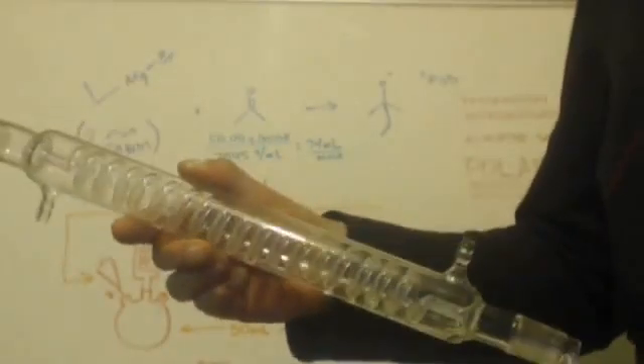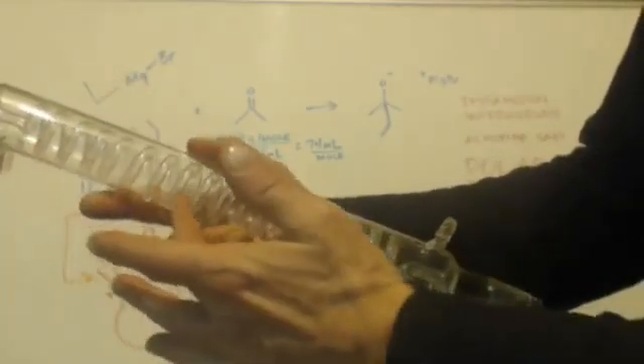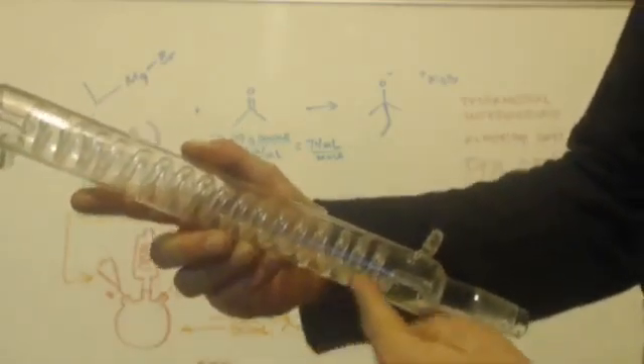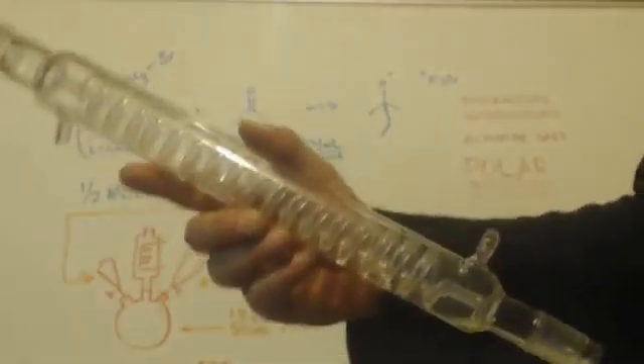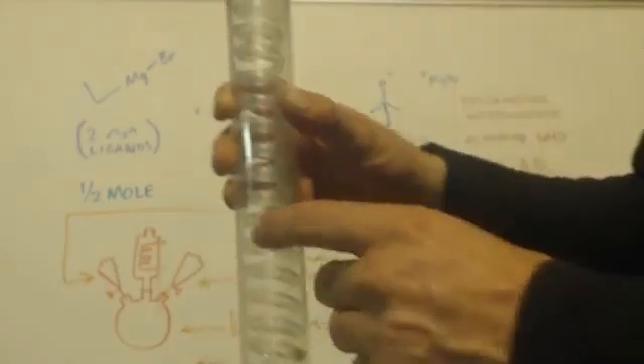I love the Graham condenser. However, if you're distilling, you have to have it vertical — you can't have it at the angle of a regular distillation apparatus. You have to have it come over so gravity gets your product through. Otherwise it just gets stuck — it turns into liquid before it gets to the end and you have puddles in each coil. So this is terrible for distillation. But for reflux, when you have it straight up and down and you're using gravity, even though the coils aren't totally horizontal, they're sloped a little so the product can slide back down. If you have it straight up and down, this is the best thing you can get for a reflux condenser.